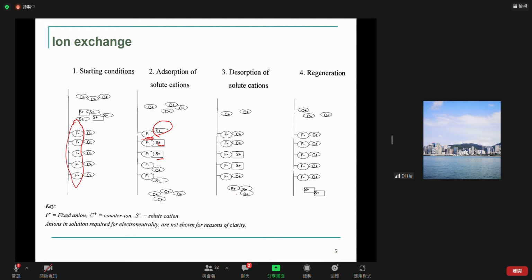Okay, so this is how it works, and you run the mobile phase. For the mobile phase to go through, how can we elute this analyte? There are different parameters you can play with. For example, definitely we can think about pH. We can also play with the counter ion, so a different mobile phase.